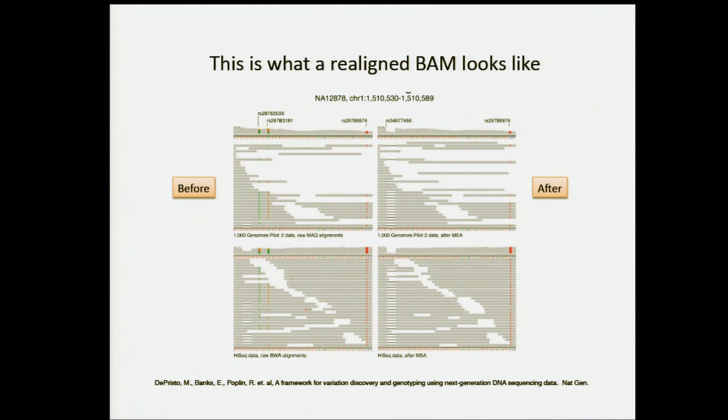Now you run it through the realignment process, and things look very different. Those SNPs go away. There's just a homozygous deletion. So these are just artifacts. Right? Now this SNP didn't go away, even with the alignments perfectly well suited towards this data. So it turns out that the true genotype here is that our sample is a homozygous variant for this deletion. And again, there's a little homopolymer run.